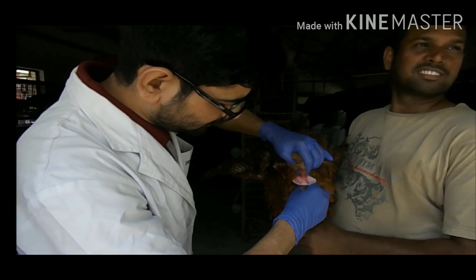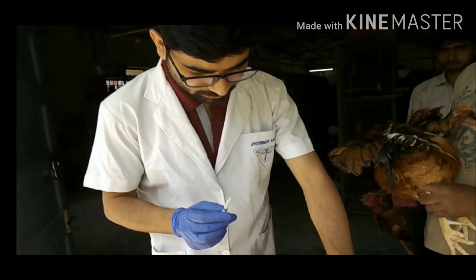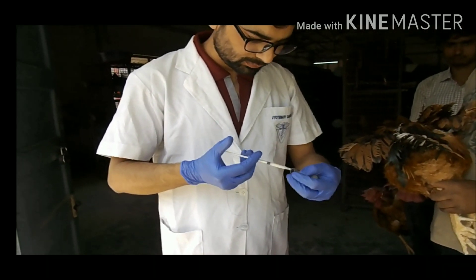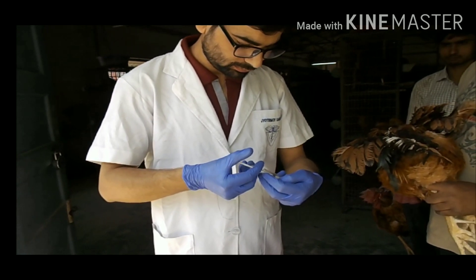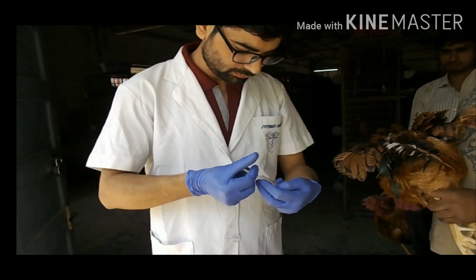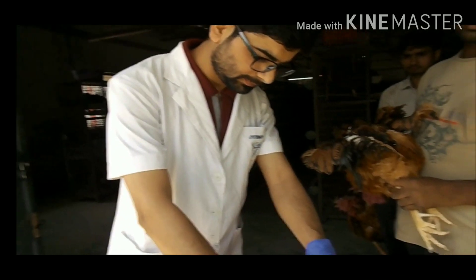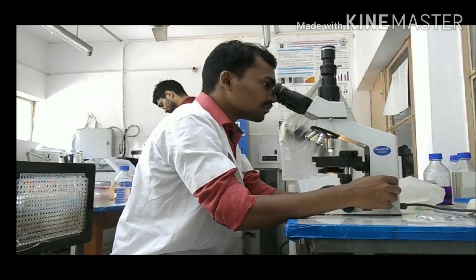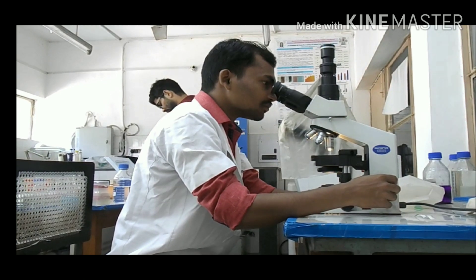We are getting neat and clean semen collected into the funnel. Here I have taken the sample into the tuberculin syringe in order to measure the volume. From each cock, about 0.5 ml was obtained — these were naked neck and frizzle fowl breeds, both yielding about 0.5 to 0.6 ml of semen.